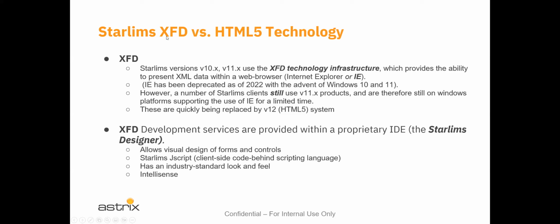The biggest difference, the most glaring difference, is that XFD required Internet Explorer under all circumstances. It was not able to operate inside of Chrome or Firefox or any of the other typical web browsers. They needed to move into the 20th century and move up to web browsers that were able to handle HTML5 technology, and that's why they essentially moved on to this V12 product to handle HTML5 technology.